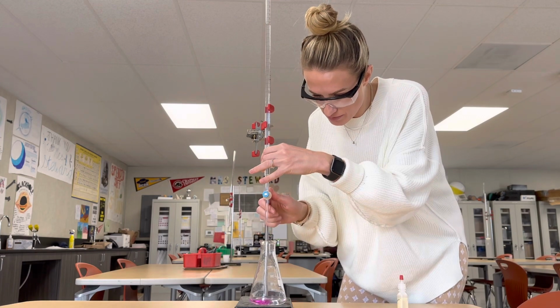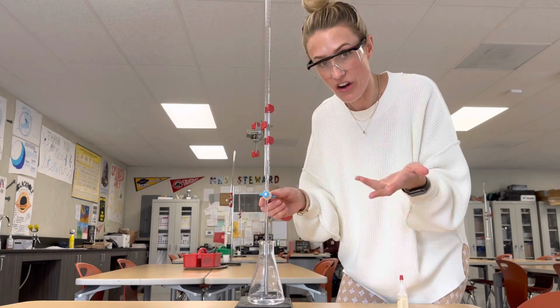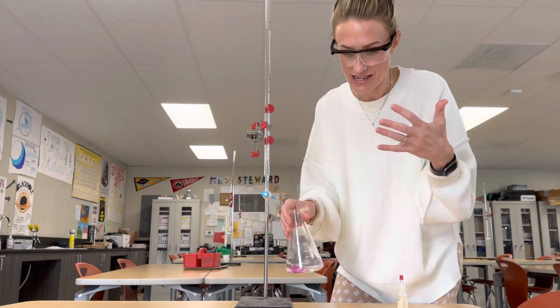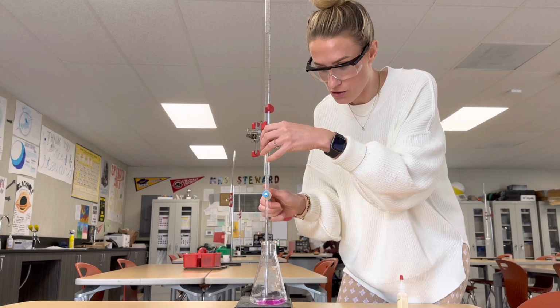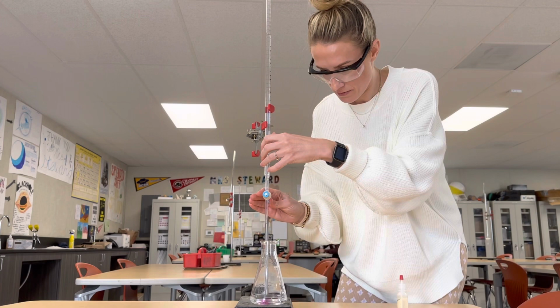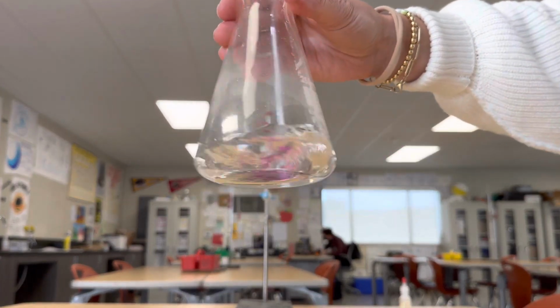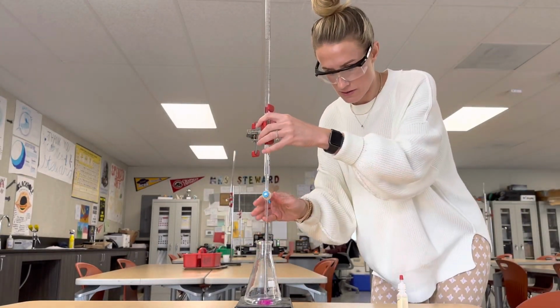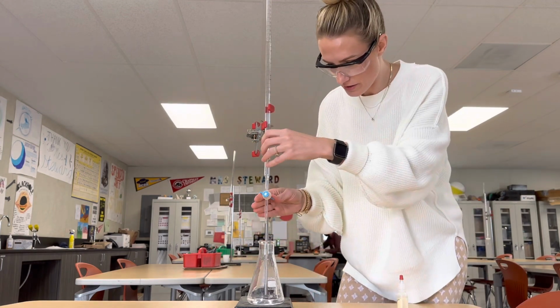And then again, I'm going to add some more, and then I swirl, and then as it's taking a little bit longer to change back to clear, I'm going to start adding less, or even you can say add more slowly, just because I don't want to get it too basic. The goal of this is a neutralization reaction. And so here you can see it's pink, and then you swirl and it disappears. Now it's taking a little bit longer to change back.